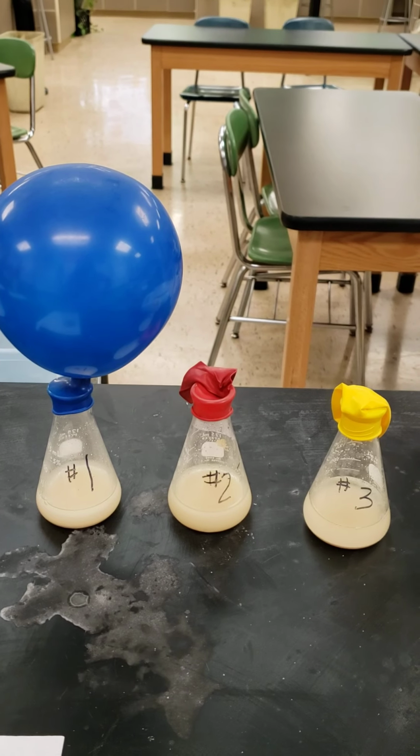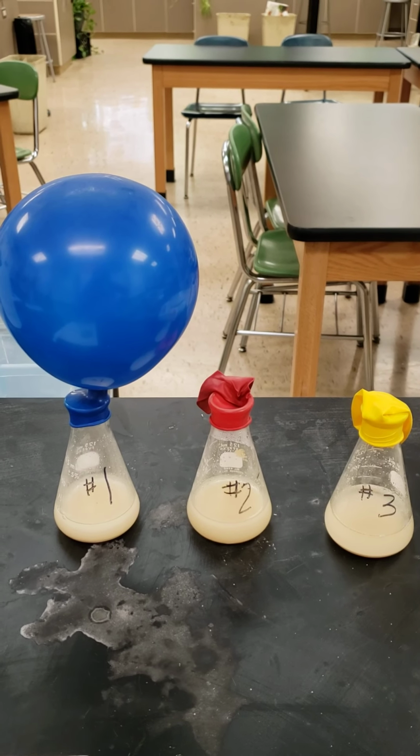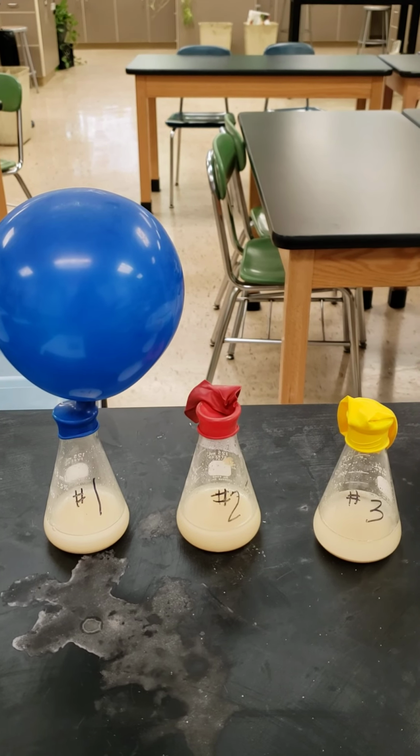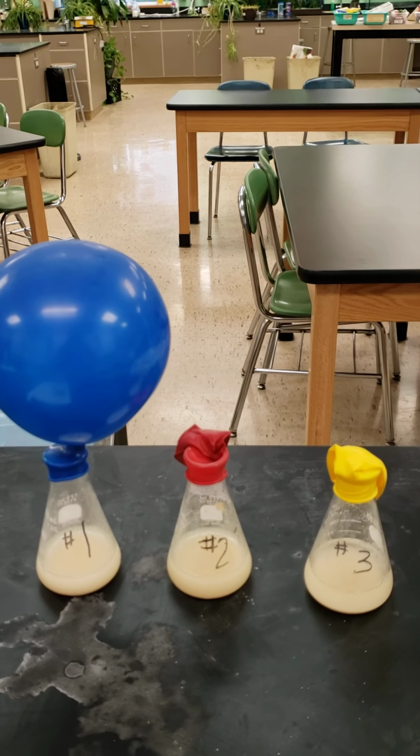So, did we see yeast doing cellular respiration? I'm actually going to do a 4th video here. I'm going to take these flasks. I'm going to take this flask, and I guess I'll take one of these, and I'm going to put some methylene blue in. Okay, that'll be video 4.